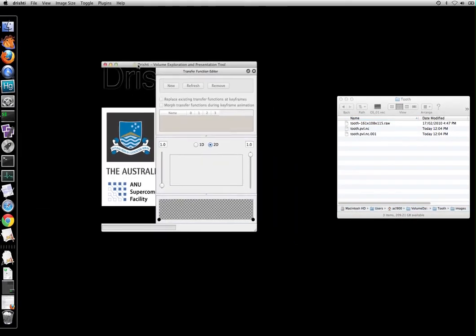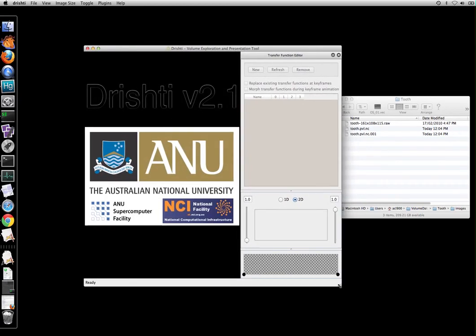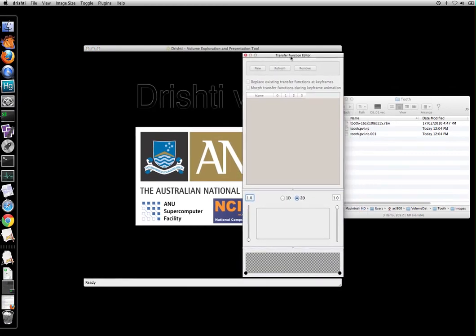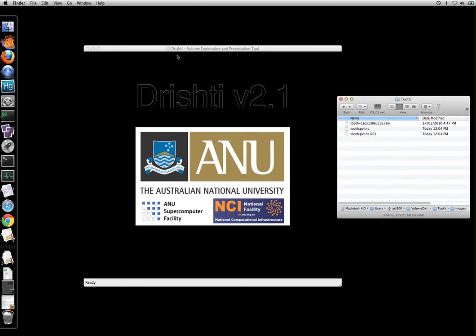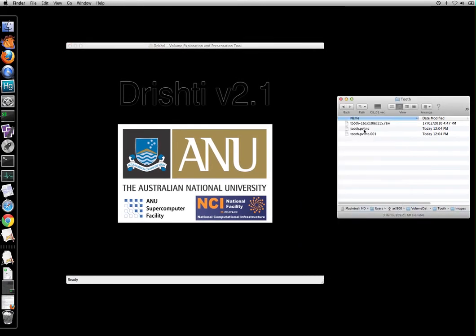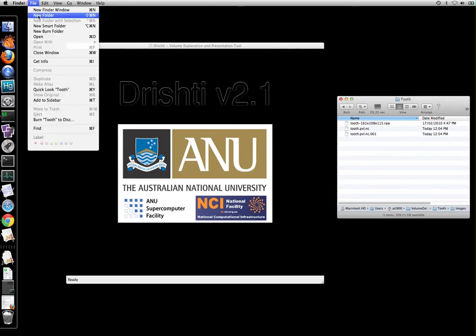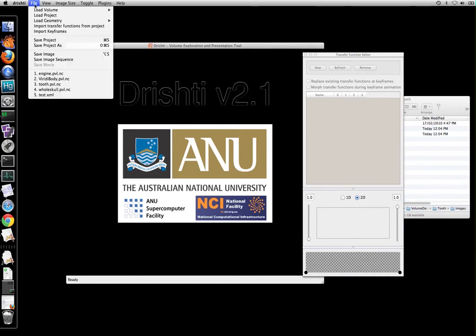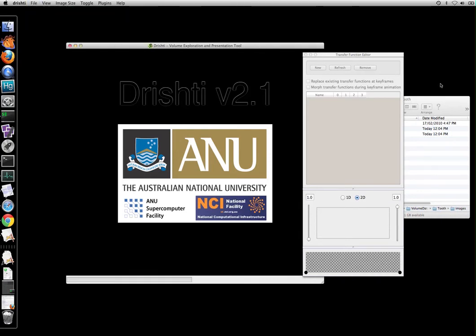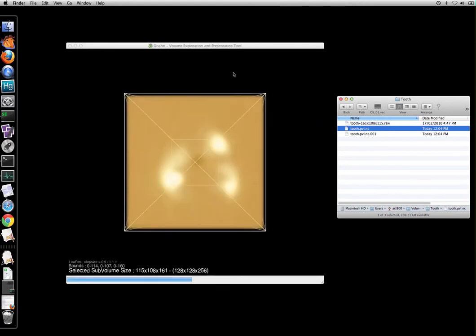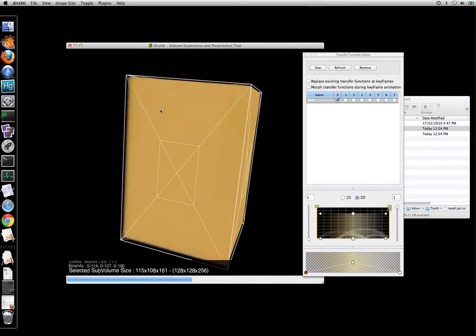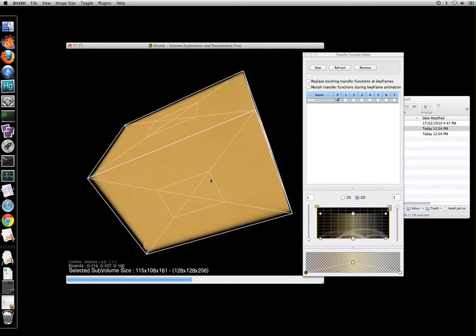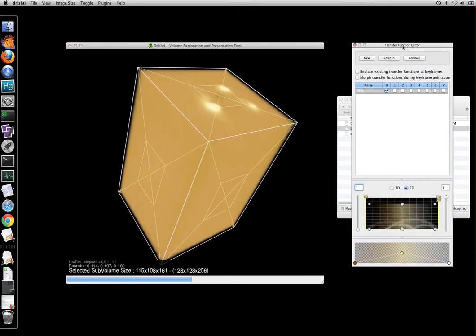So this is the Drishti render. Now here again like importer you can drag and drop the data into the render window or you can go in and load the volume. So let's just drag and drop. Now here we use this pvl.nc file and then drop it into Drishti render. So it has now loaded the data.